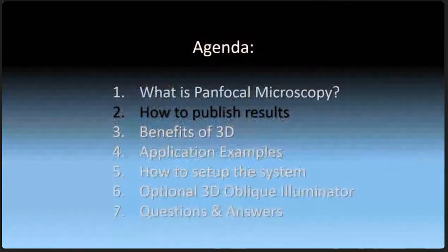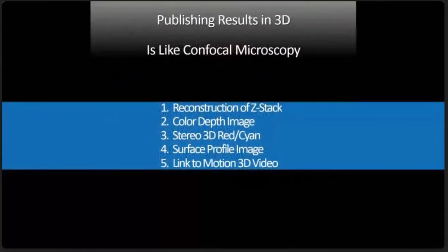So, how do you publish the results? Well, the basic way to publish results is similar to confocal microscopy.